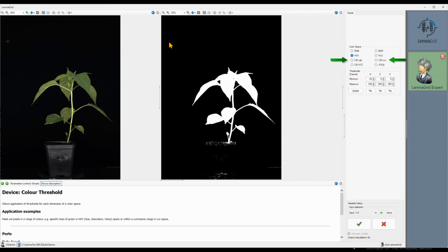The color representation in RGB, HSV, and HLS is fairly simple to understand. On the flip side, if you calculate differences between colors in these color spaces, the value between two similar colors might be larger than the difference between two less similar colors, at least if we judge color similarity by the human eye. The color spaces CIELAB and CIELUV intend to match the human perceptions of colors better. The differences between colors in these color spaces match the human perception more closely, but not perfect. Hence, we have two different color spaces.